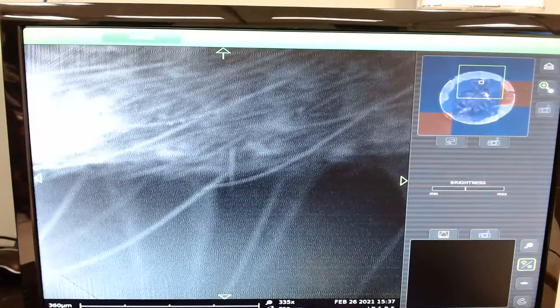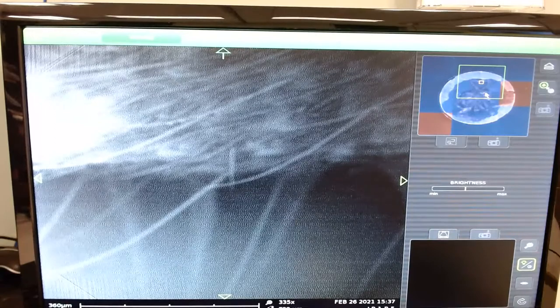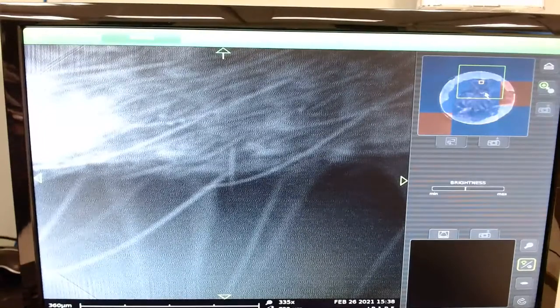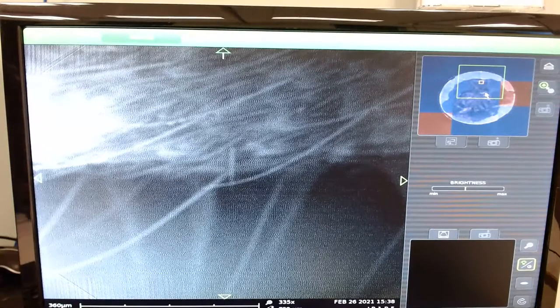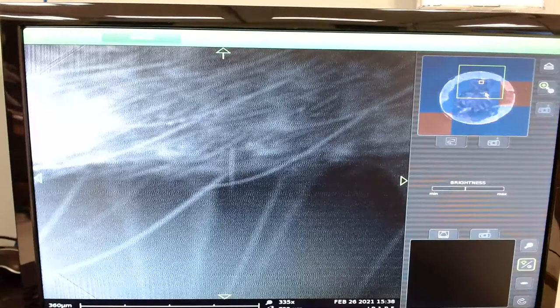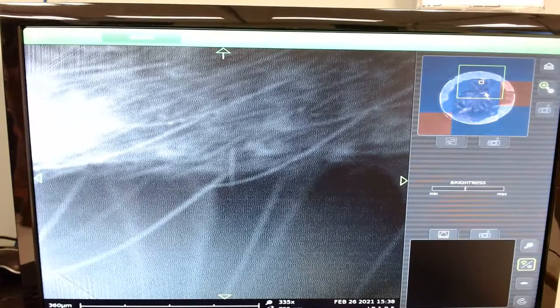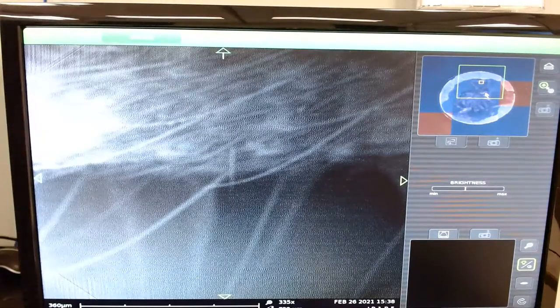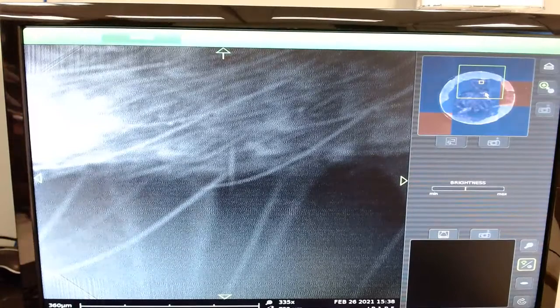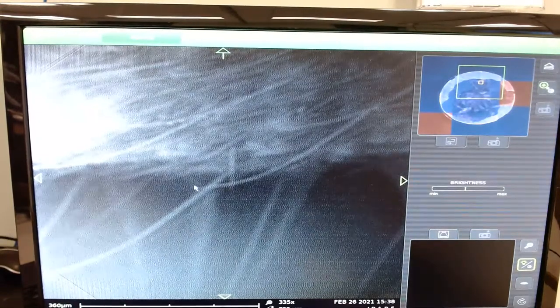I got some cool, like, that's a fly. Isn't that wicked? This was on a fly. I'm kind of waiting for them to sputter that sample. He has a fly, but it looks up, so we're going to look at a fly with the eyeballs facing up. You have to re-sputter it anyway. And also the carbon adhesive that we use conducts through, but I think it would be very difficult to take the sample off. So that's what we're looking at.